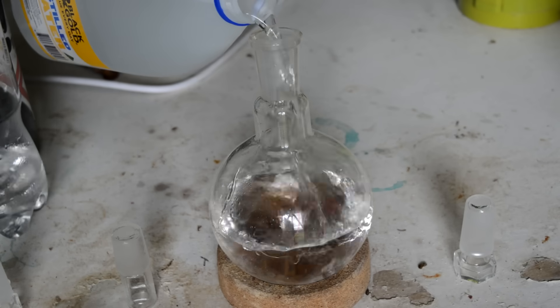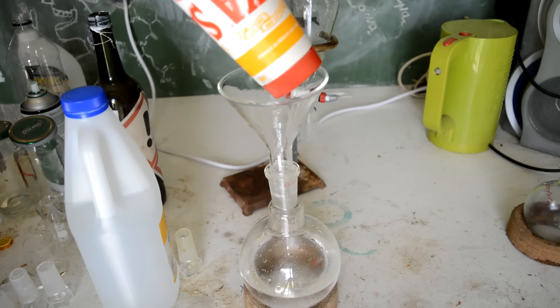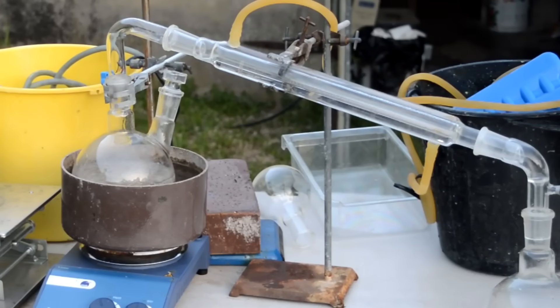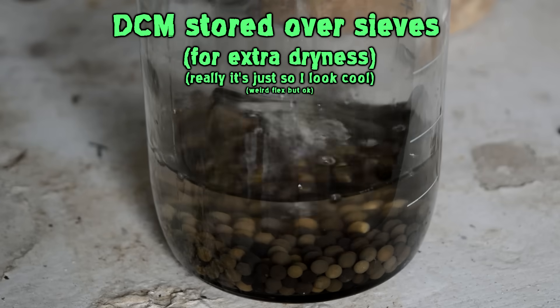To clean it up, we wash it with water to wash out any methanol. Then we just add a couple of pinches of kosher salt. Shake it around to get rid of the last bits of water. And then re-distill it. And hey presto, we have pretty clean, reasonably dry dichloromethane.